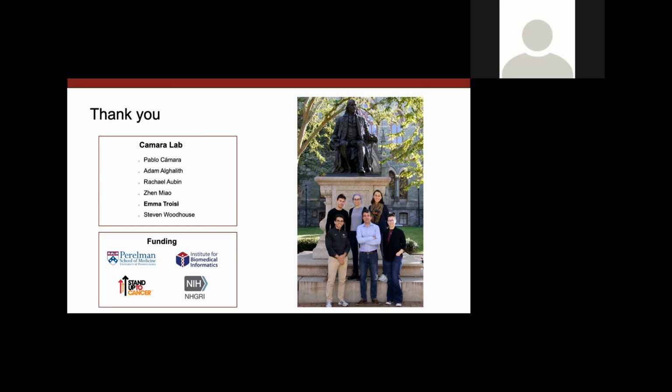No, there are a few recent ones, I think Seurat came out with one that uses transcriptome information to anchor FISH and single cell RNA sequencing. But no, we use the protein information because that's what we have from Codex and CyTOF. They have the protein information.